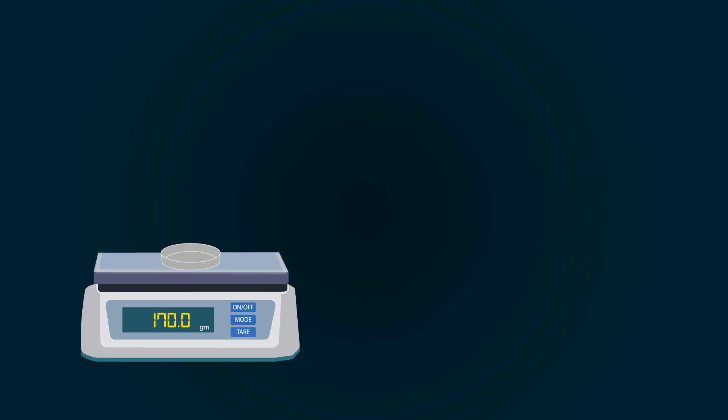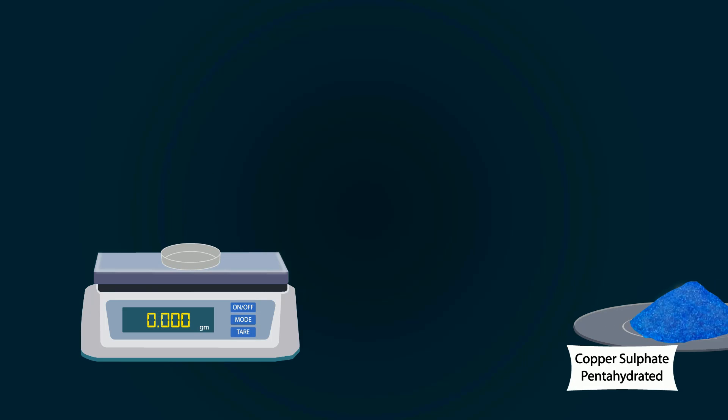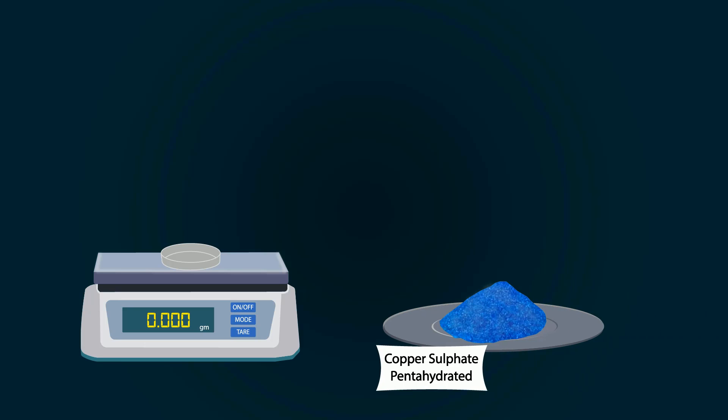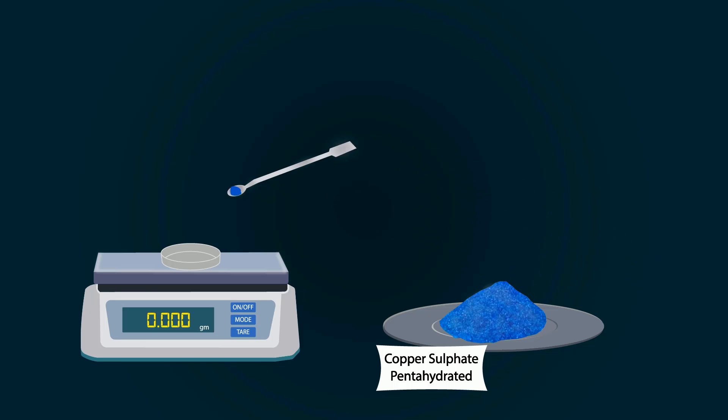Now take copper sulfate pentahydrate chemical. You can put this chemical into the petri dish with the help of a spatula. Weigh precisely 1.73 grams.